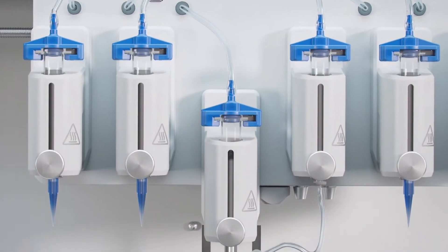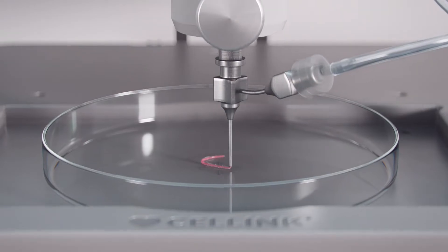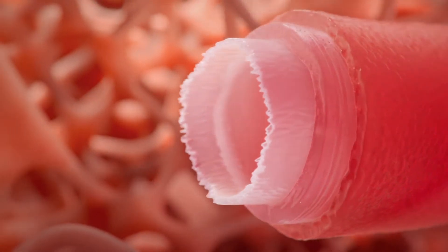Using multiple print heads, the Bio X6 desktop system can simultaneously print with six different Bio Inks, printing incredibly detailed and complex living structures.